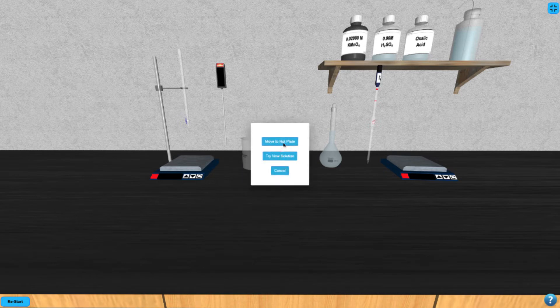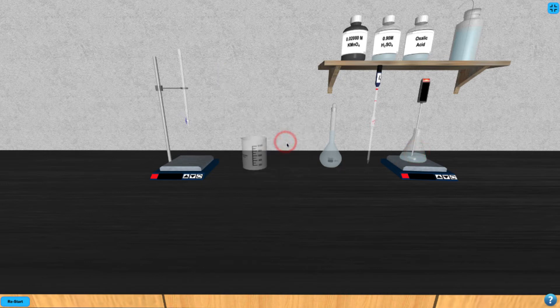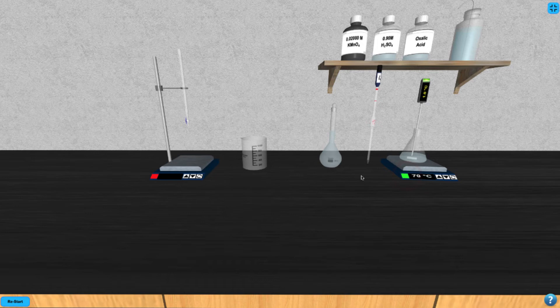Now you can click on the Erlenmeyer to move it to the hot plate on the right hand side. Click on the Erlenmeyer to add the thermometer to it and turn it on by clicking the button at the top. Turn on the hot plate to start the heating process.